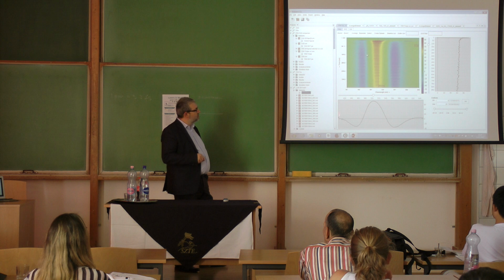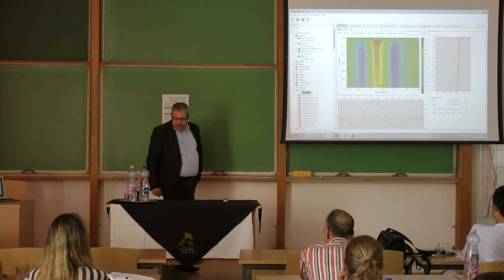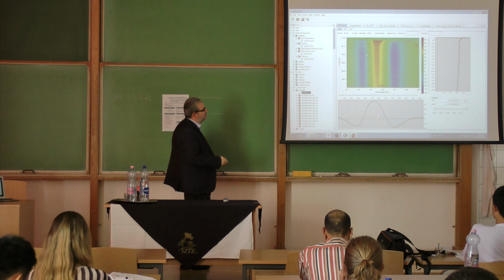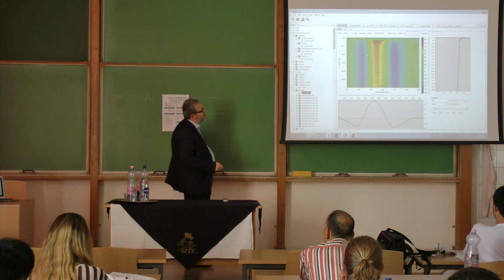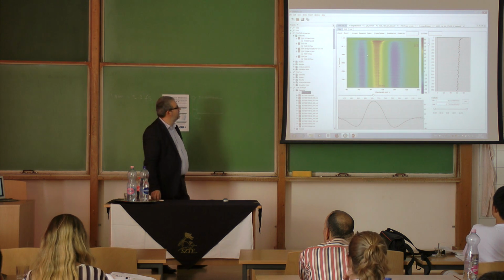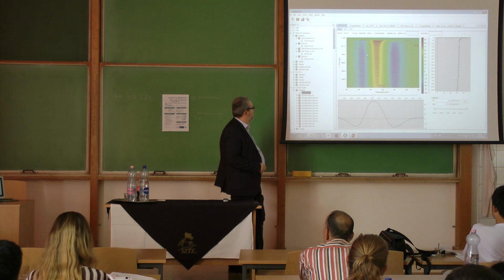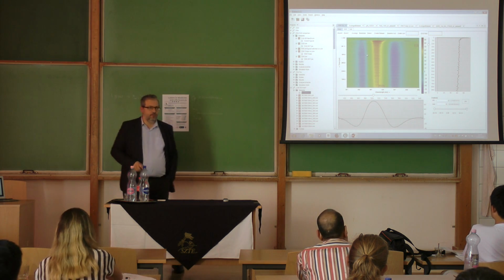What I also didn't mention too much, but what you can see here, is the so-called ground state bleach. This is just the S0, S1 transition, on the left side. Here, this is the excited state absorption, because these species can absorb some light. And this one is called the stimulated emission, because your probe beam can stimulate a part of the population. That's why you have again more light than at the beginning. So this is the typical spectrum.